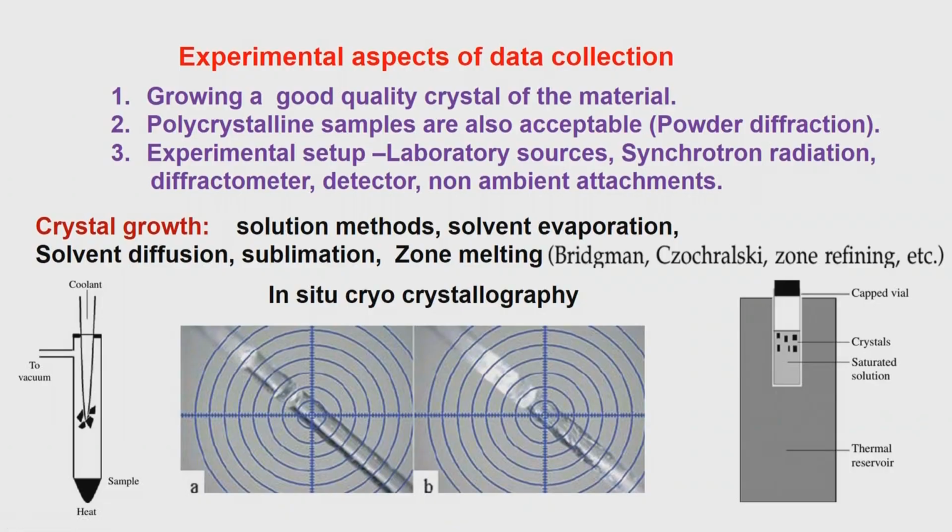So, at this time we are in a position to look at the experimental aspects. So, this is now becoming a little more critical from the point of view of what we can do from knowing all the rules of symmetry and the details of how the molecules arrange themselves in the given space group and so on. Obviously, the job would be to see where the atoms are and determine the positions of the atoms, and eventually find out how the atoms are connected to each other, look at their properties, and eventually relate the property of the crystalline material to the external physical property it exhibits.